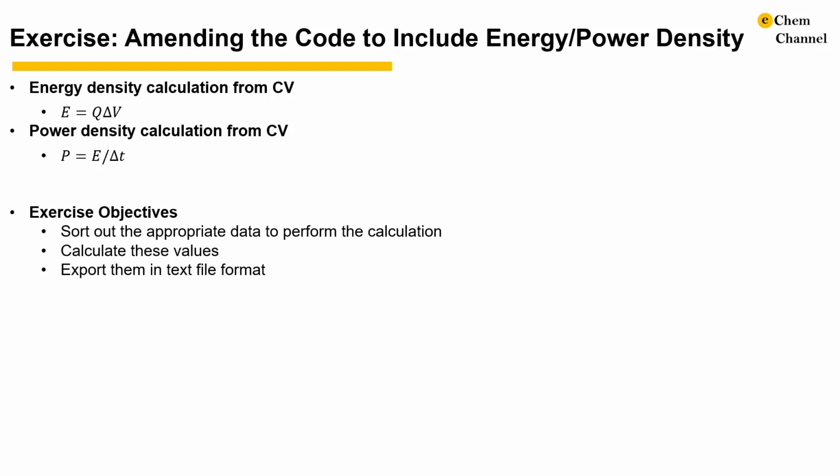Since a comment in the previous video asked for power density features, I decided to include this as an exercise. I will provide a recording of how I write this feature next, but you are encouraged to write this one on your own if you are interested in learning this method.